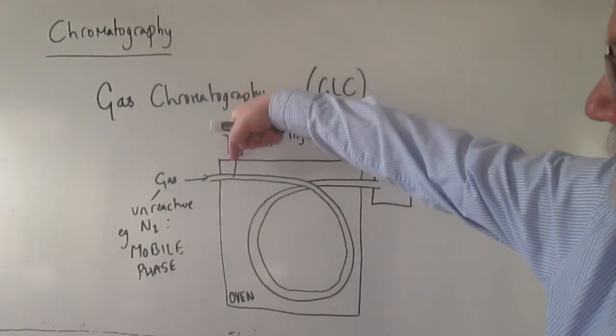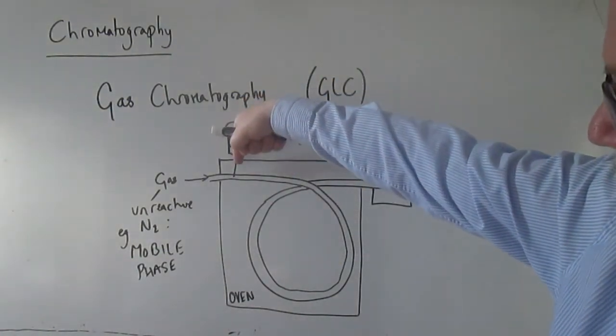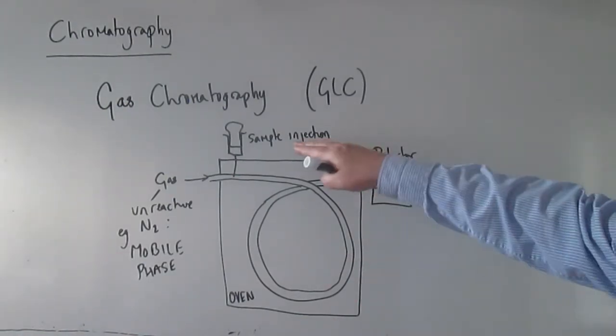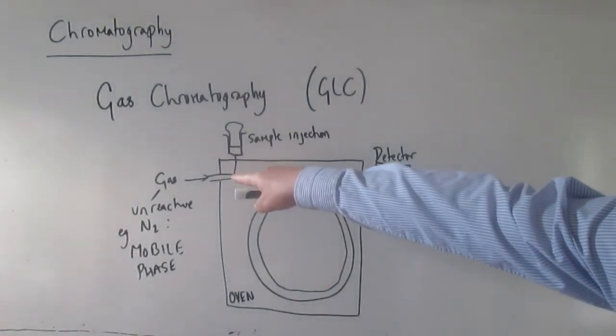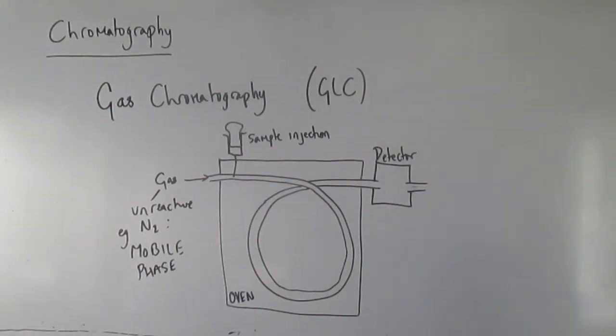The sample is injected here, near the beginning of the tube, so there's just a syringe which pokes into the oven and allows you to inject a sample into the stream of flowing gas. And of course the reason that we put it in an oven is that you want the substances in the sample to vaporize, so that they will go into the gas phase and get carried through the column by the gas, which is the mobile phase. The temperature of the oven is going to depend on what it is you're trying to separate, but it needs to be hot enough that the substances you're interested in will vaporize when they get in there.